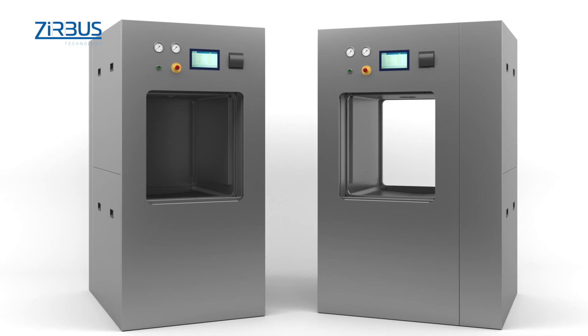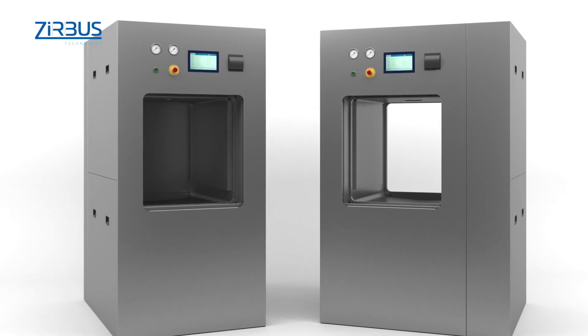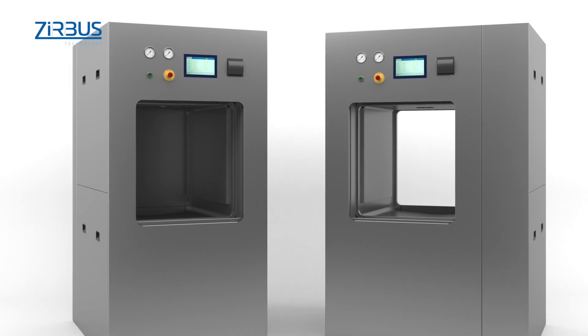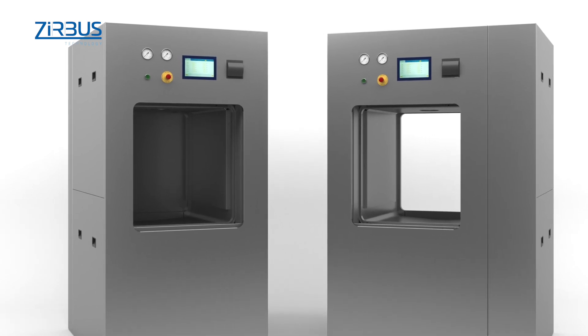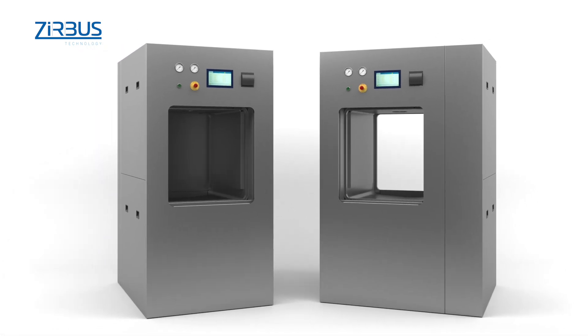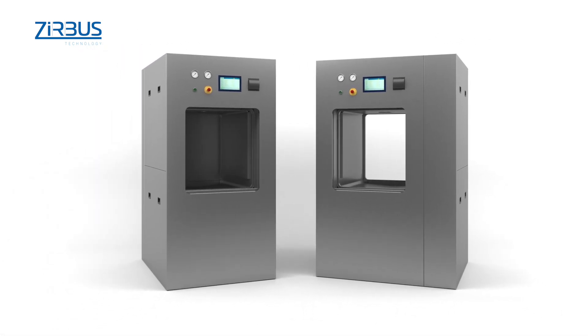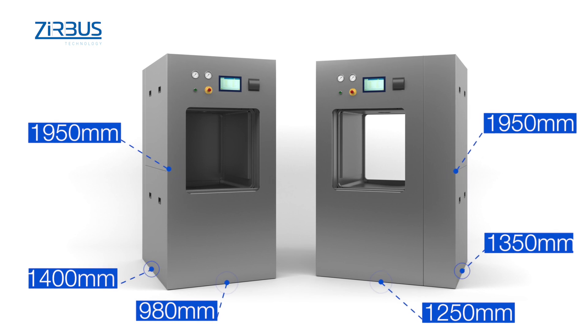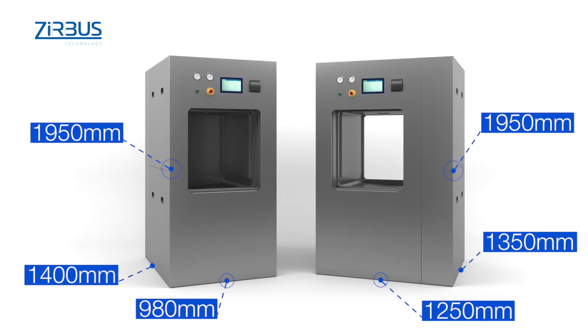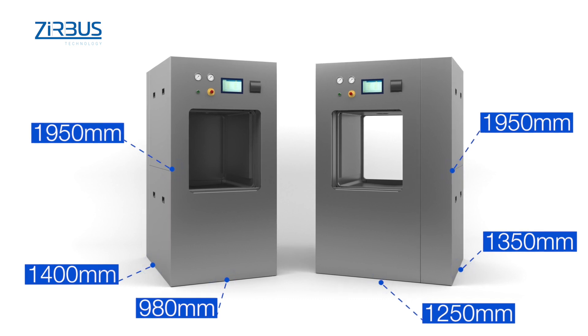Unlike the cylindrical chamber model, this sterilizer chamber is rectangular, allowing virtually full use of the available volume. This compact design allows users to save space. Compared to other commercially available instruments, the exterior dimensions of the Series 6 autoclave are exceptionally small relative to the size of its chamber, allowing it to fit through most standard doors.